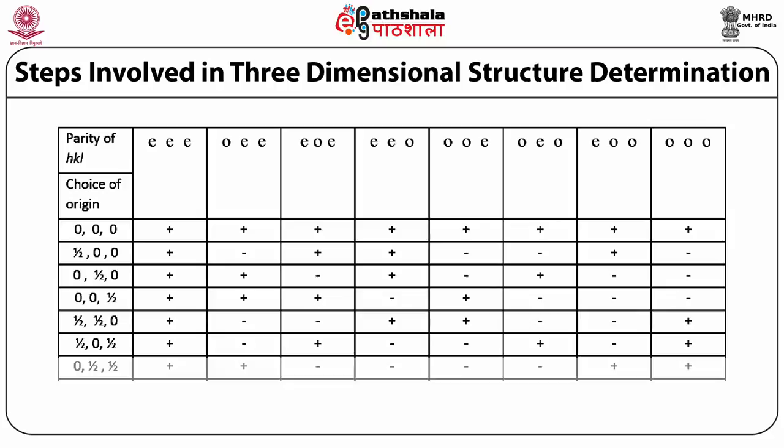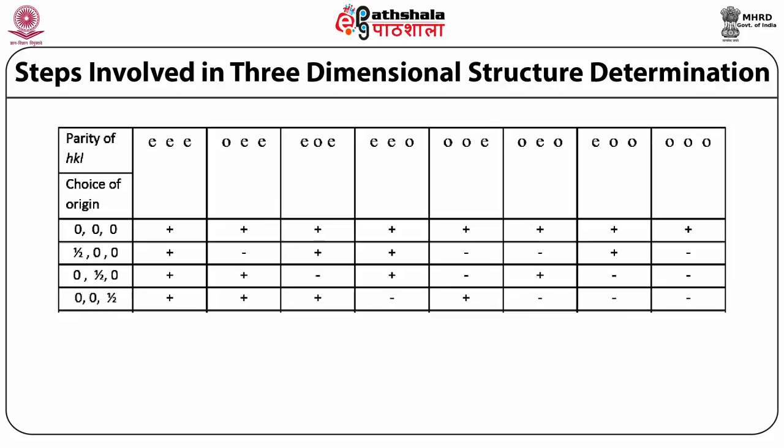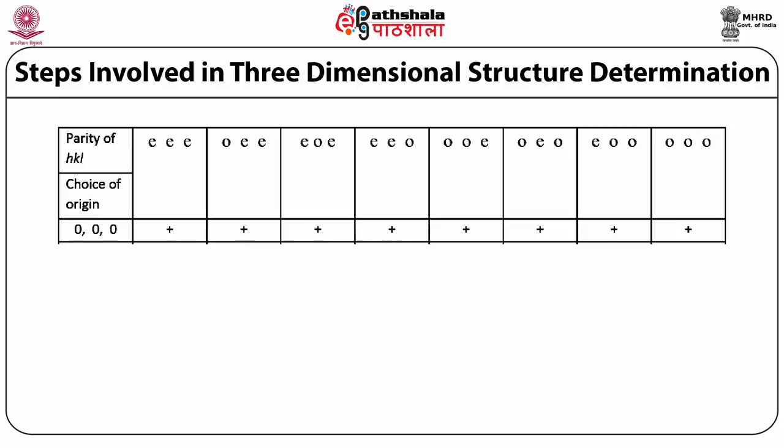So now what you do is, at the bottom of the convergence list, you take 4 reflections belonging to this parity and assign some sign. Then you proceed further to get the sign of the other reflections for the centrosymmetric case. So this is the way, since it has been done by hand, this is known as the hand propagation method.